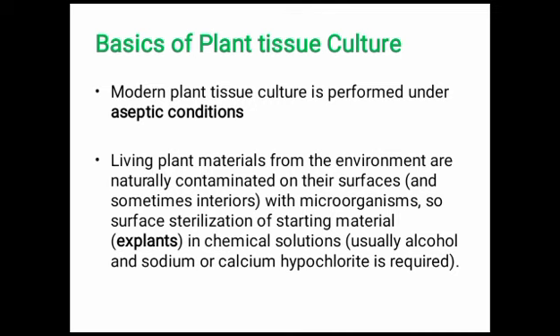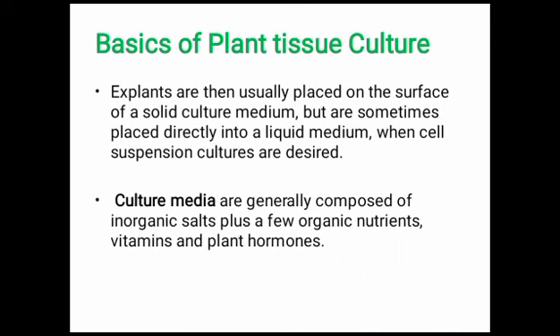Which sterilizer is used? Usually for the sterilization of explants, alcohol and sodium or calcium hypochlorite is required. Next, explants are usually placed on the surface of a solid culture medium, but are sometimes placed directly into a liquid medium when cell suspension cultures are desired. So it depends on the culture.